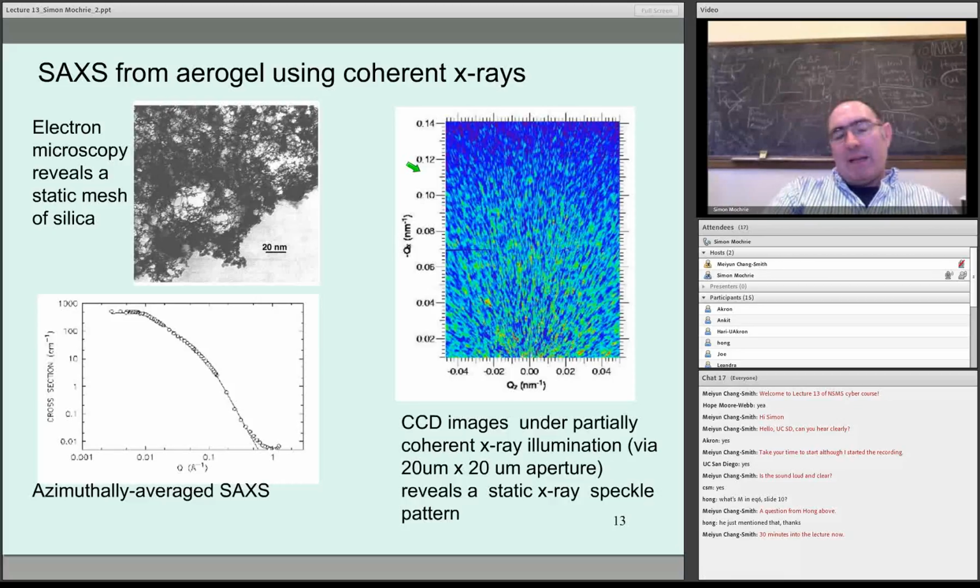Now, you might expect to see a circularly symmetric scattering pattern, and what you're seeing here is just a portion of that circularly symmetric pattern. So the scattering is larger than the CCD detector that we're using in this particular case. The zero position is somewhere down here. We don't have any scattering over here. The scattering at the sides doesn't go too far. But you can see, if I trace it around, that this is actually roughly circular.